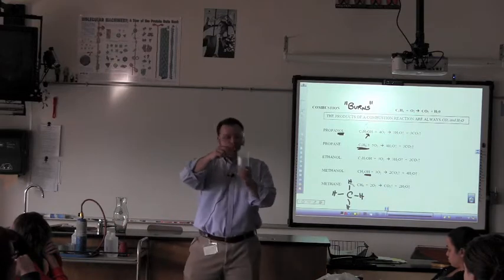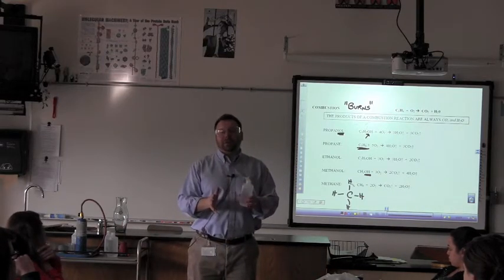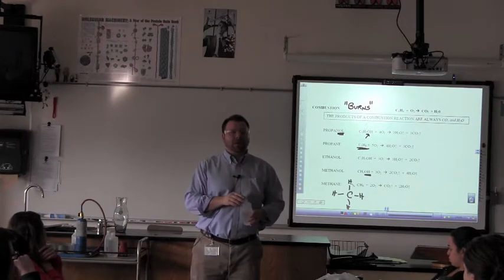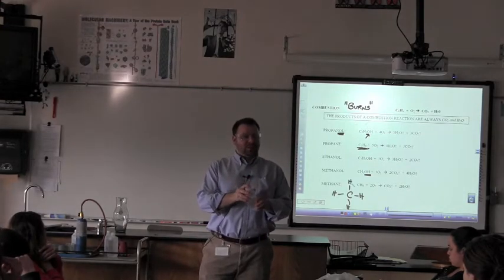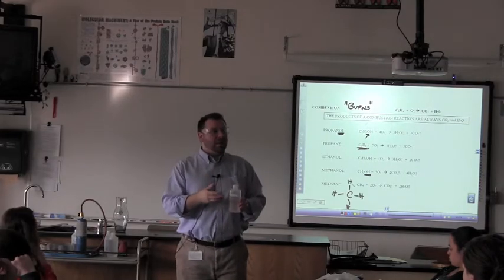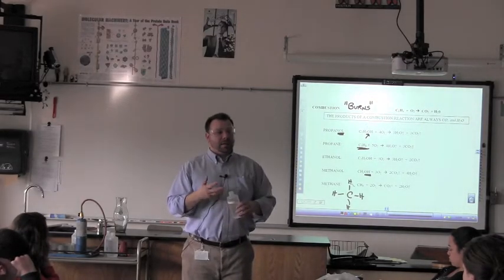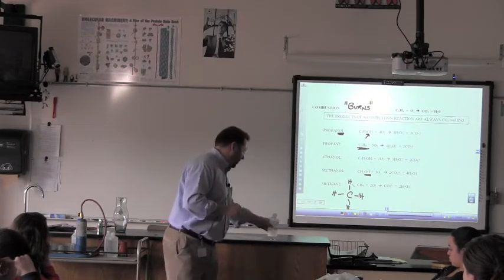So here's your methanol, just as we would expect. It is a liquid at room temperature. However, it can vaporize very quickly, so this is something that we want to be careful with. In fact, when you hear about some lab accidents, there was actually just one in Minnesota, I want to say, not too long ago. It was basically due to methanol. And if you leave the cap off of this one, it can vaporize quickly, and this can actually cause some major problems there. So we do want to be a little bit more careful about that.